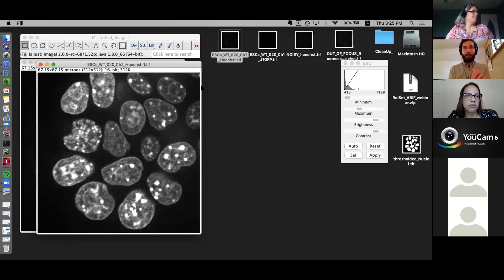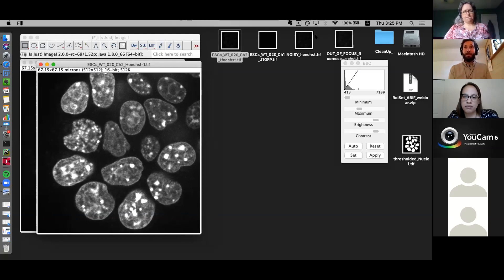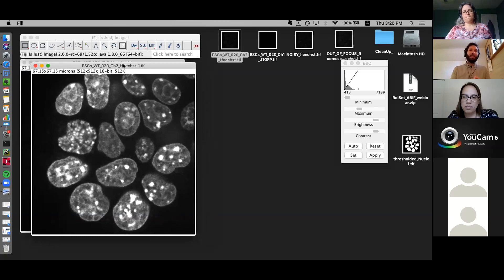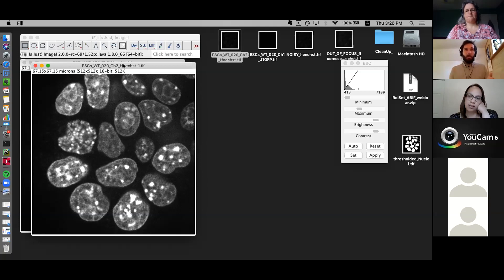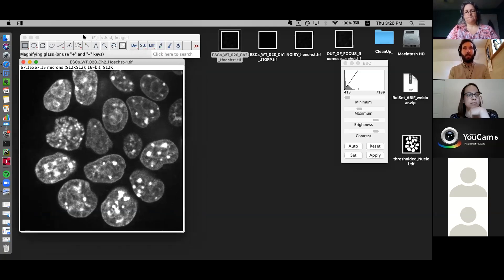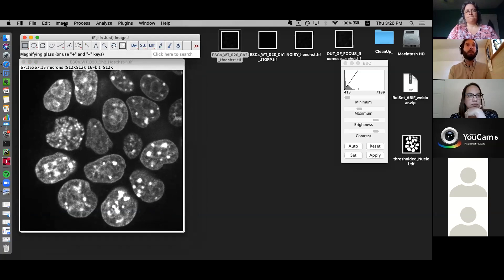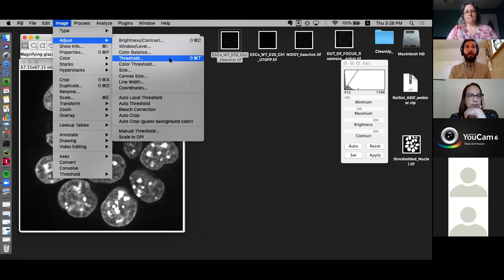What we want to do now is figure out a way to get the objects of these nuclei. There are many different ways to do this. The simplest is to try to establish a threshold — simply an intensity value that delineates between the background and the signal. That can be straightforward but tricky depending on the background and noise. This image should be relatively easy to work with. In Fiji, the simple way is: Image, then Adjust, then Threshold — or use Control/Command+Shift+T.